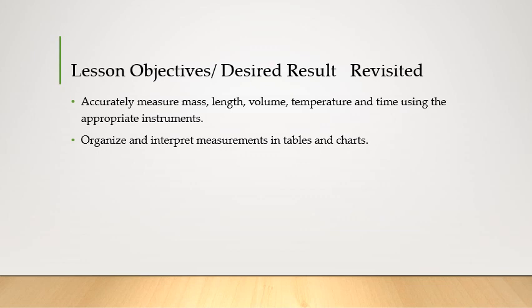So at this point, you should have an idea on how to accurately measure mass, length, volume, temperature, and time using those specific instruments, and be familiar with how to organize and interpret measurements in tables and charts.